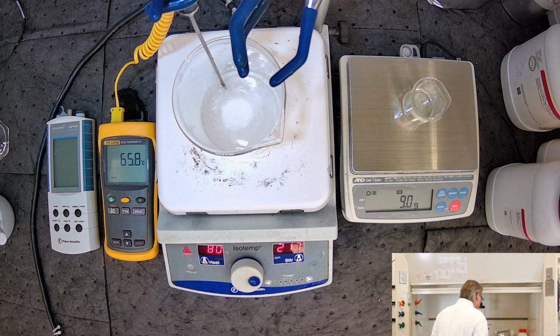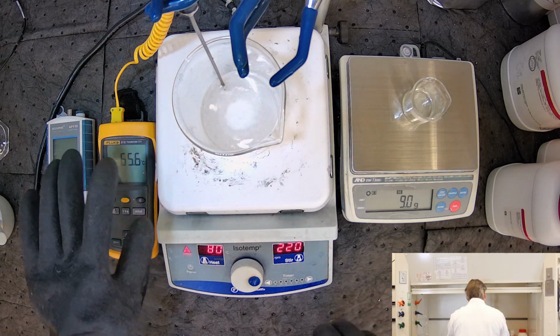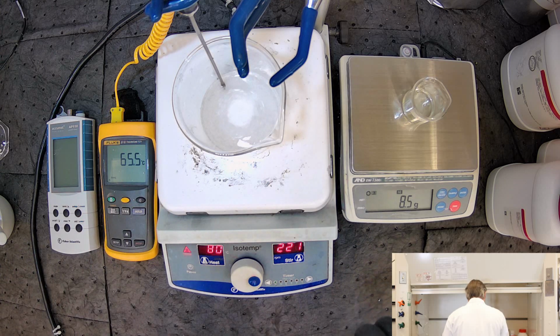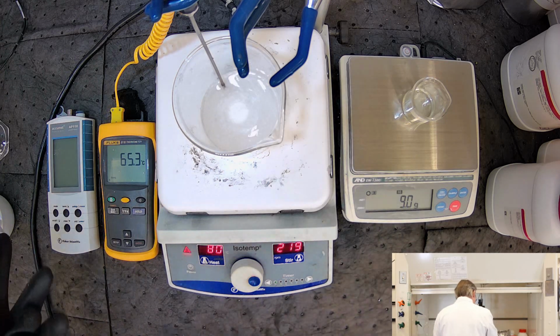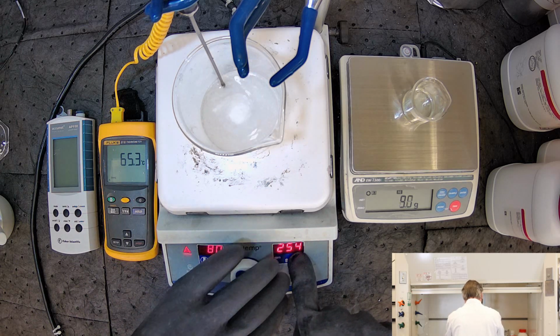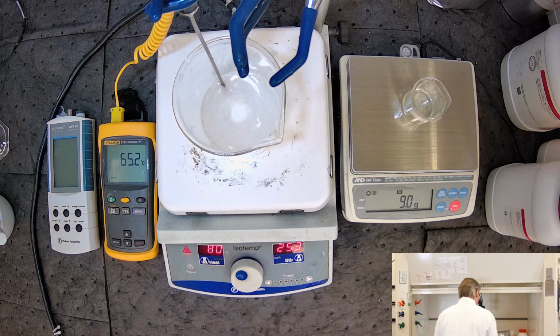What is important in some of these reactions is that the reaction could get very hot, so it's exothermic, so you would add the nicotine very slowly. In this case here, generally don't find that to be a problem, so we can add the nicotine rather quickly, but I still always recommend drip-wise additions. So once this gets dissolved to a certain point here, I'll turn the stir bar up a bit, speed up a bit more. When some of it starts dissolving, I will add the nicotine.